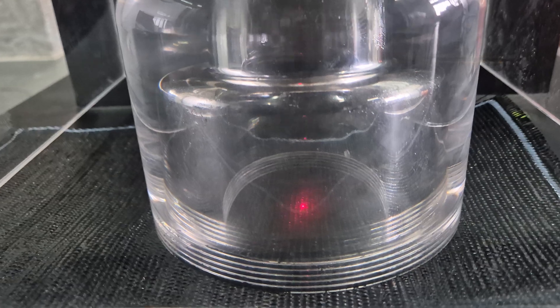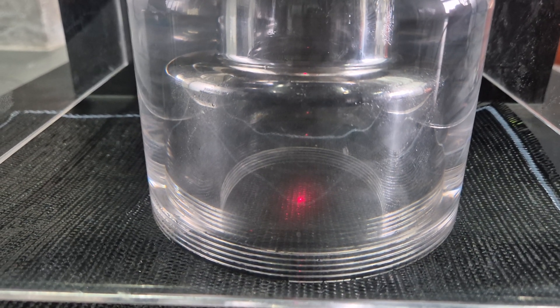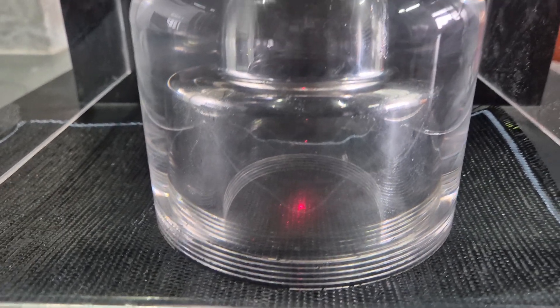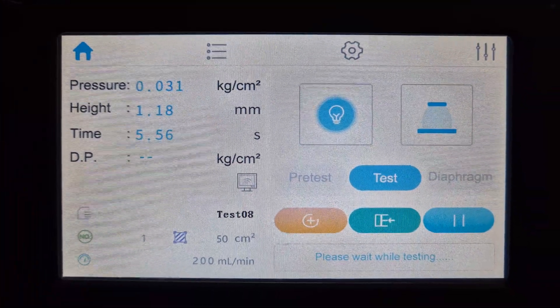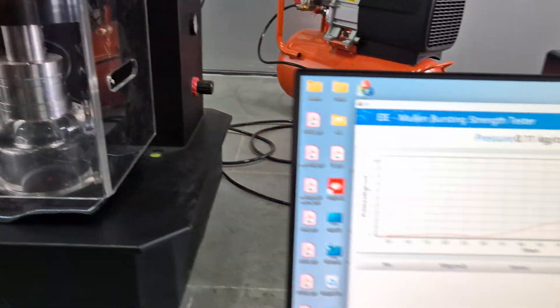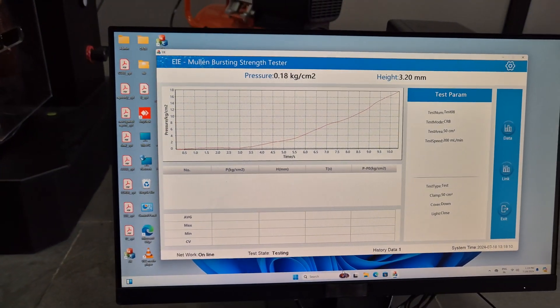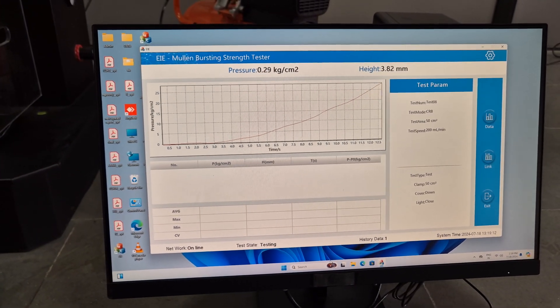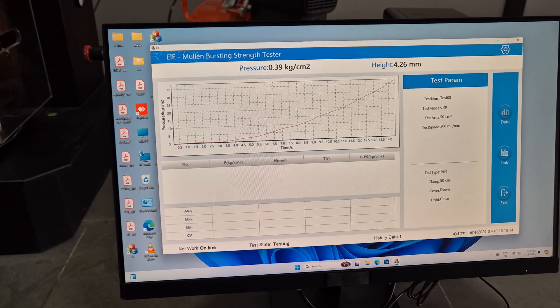A laser sensor is there for calculating height. The graph is of pressure versus time.